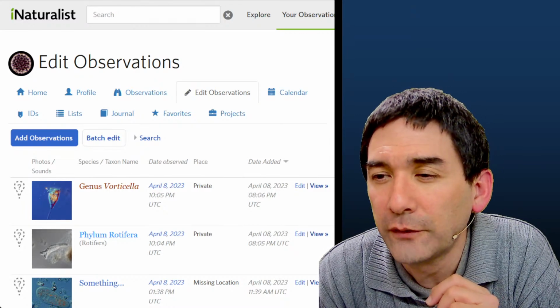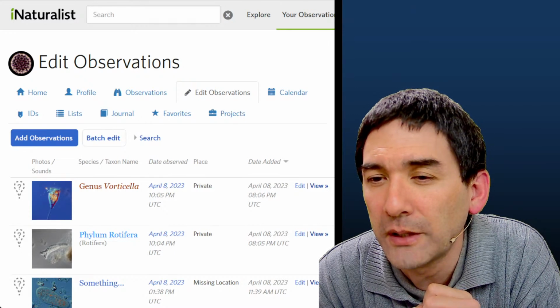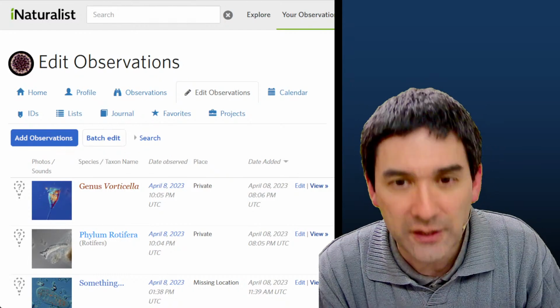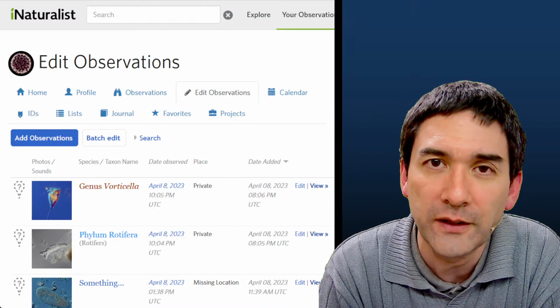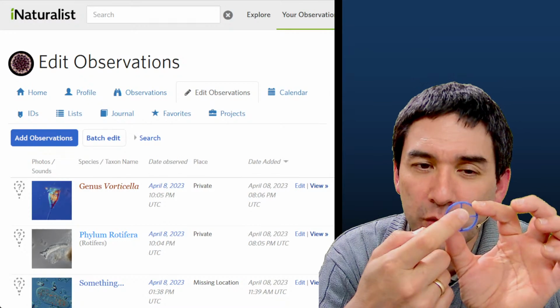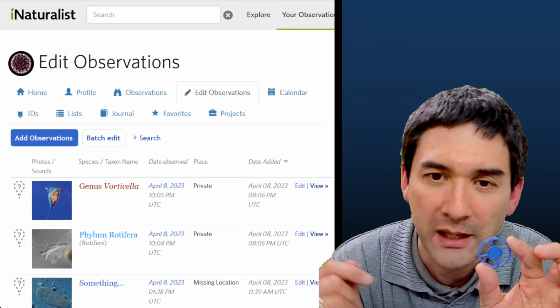Just tried dark field for some plant sections I prepared a couple of days ago. Nail polish and glycerol permanent mount and first impressions are very cool. Thanks for the motivation and tips. Yeah, and what I would suggest is once you got the dark field sorted out, then do change the color around. Especially for water samples, this is really nice because the contrast is not quite as high and you get a nice blue background as well.